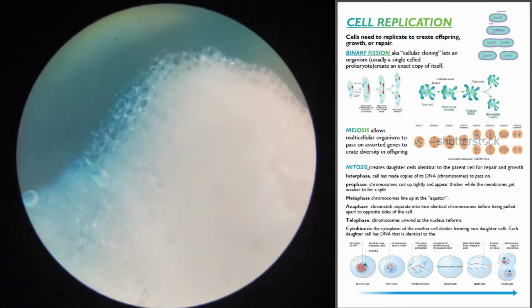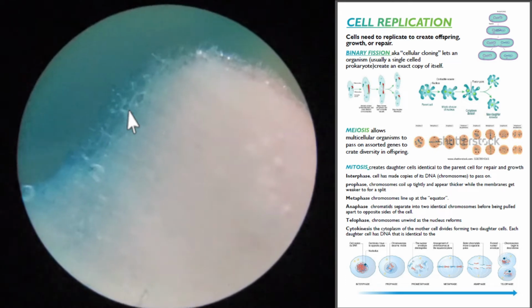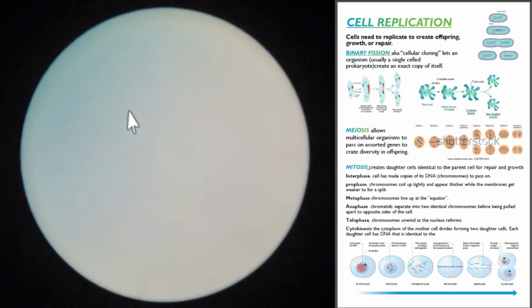Here we are. Let me snap a before picture. Right. Oop. Right there. Cool. Where can we get those? It's pretty decent. I'm not seeing what I want yet. So I'm going to go to a higher objective while methylene blue creeps along. I can always put some more in and it'll go faster.